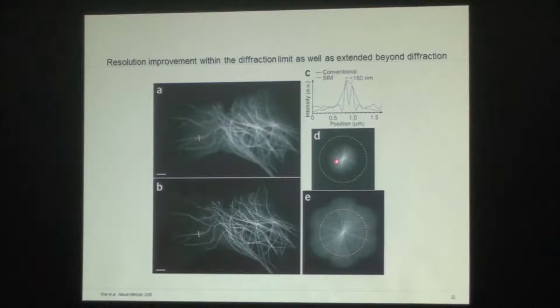The reason for that is scattering in your sample, the refractive index mismatch, and many things contributing that you don't normally collect. If the theoretical limit of a lens is 250 nanometer, nobody gets 250 nanometer in any of their microscopes, even in conventional conditions, whatever you do to the image, deconvolution or whatever.